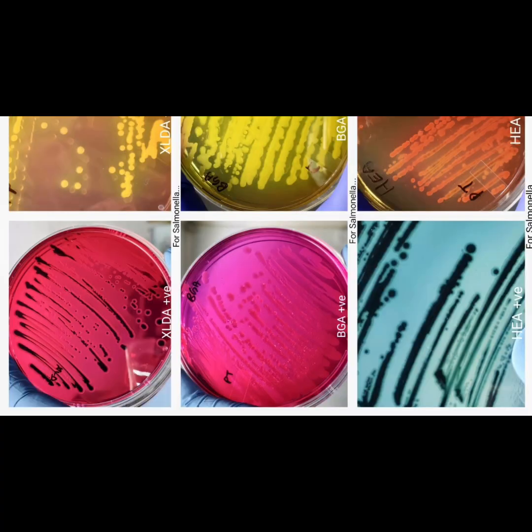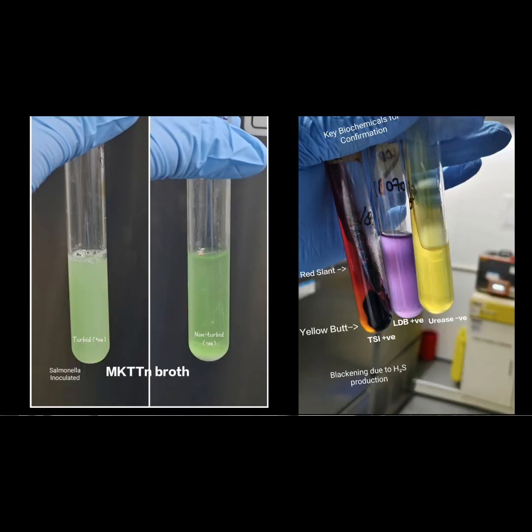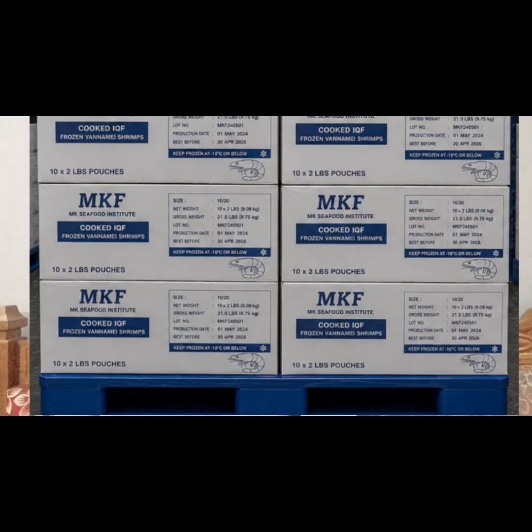Because of the continuous occurrence of Salmonella in foods, sampling plans for these organisms have received the attention of committees of national and international organizations. Each of those committees has recommended varying the number of samples from a particular lot of food according to the sampling category to which food is assigned. In the Salmonella sampling plans as per USFDA BAM methodology, 3 categories of foods have been identified.